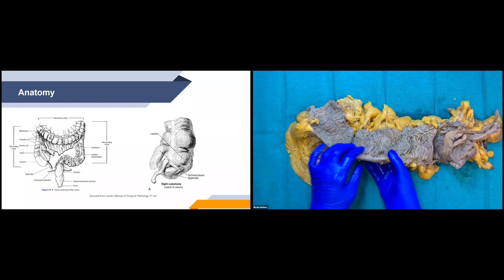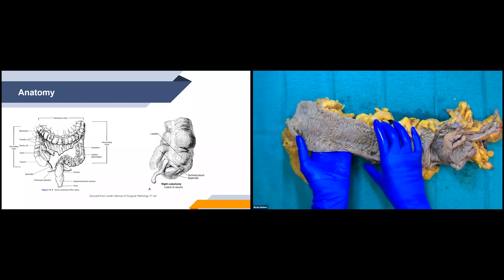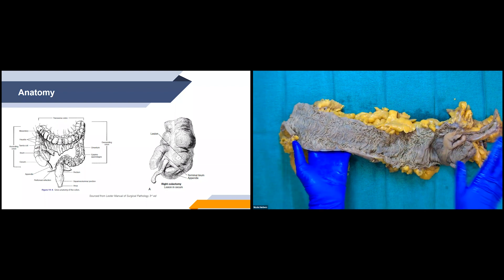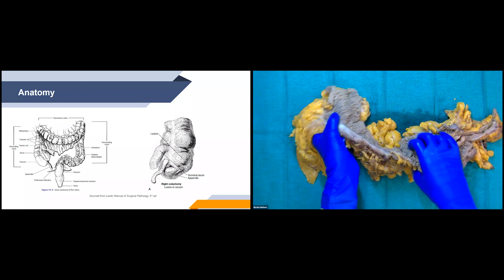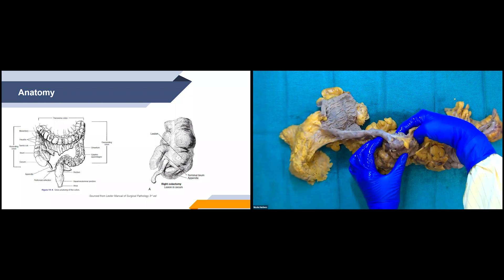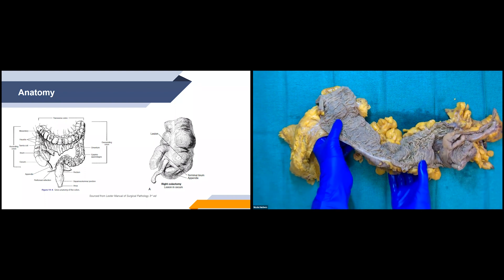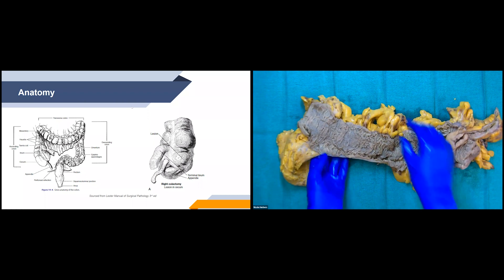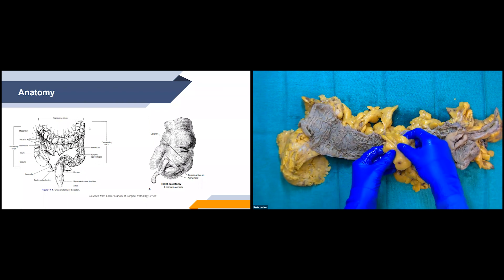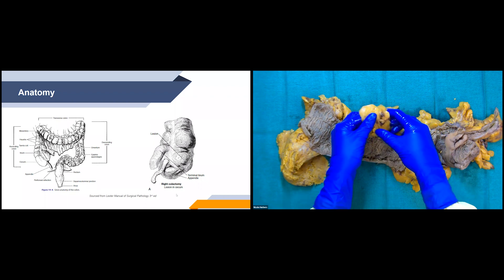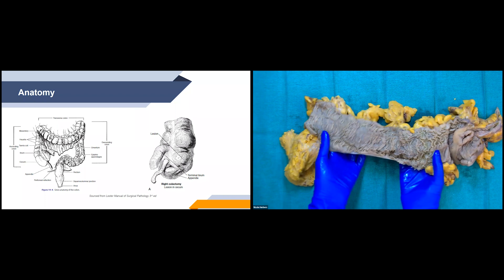It also has haustra — these kind of like pouches. It's a little hard to tell with this one because it's been formalin fixed and kind of flattened, but there are little pouches that have formed. You can see a little bit here. And then as well, epiploic appendages, which are these fatty appendages that are covered in peritoneum. And those are all just for the large bowel.